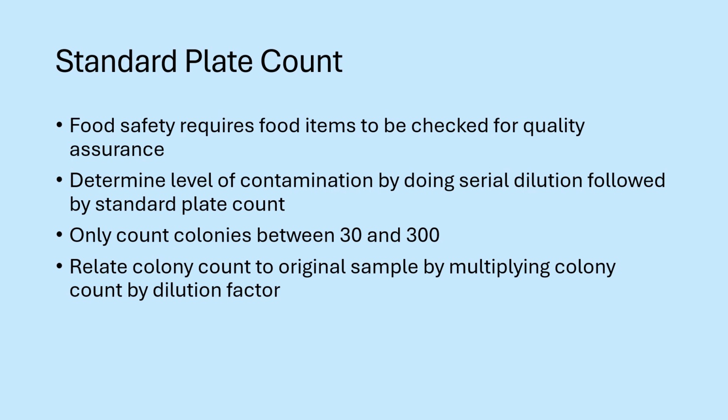Various representative samples in the processing or the production of the milk need to be tested to make sure that it is within safety limits for food quality, food safety items. So this is done, it's required by FDA. It's going to be done, like I say, in the production of the milk. You want to determine if there's a level of contamination where it's unsafe for human consumption.